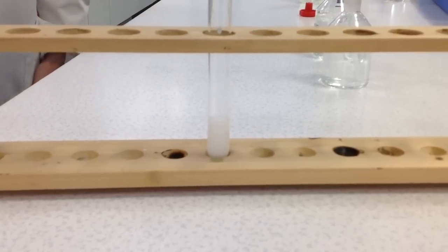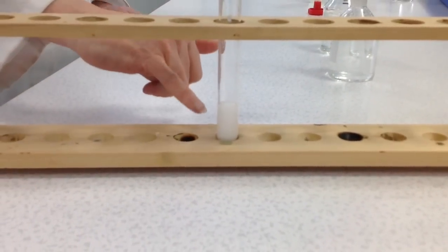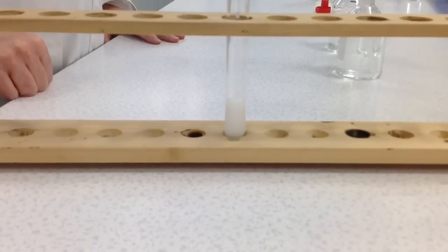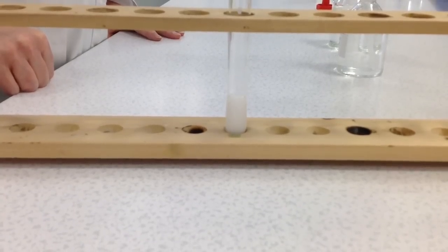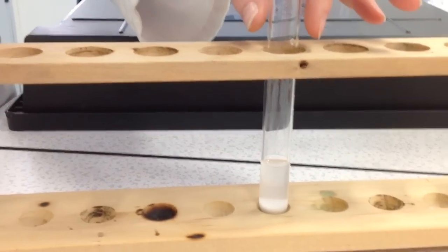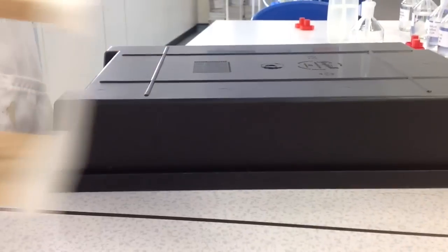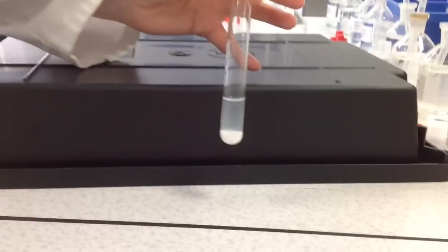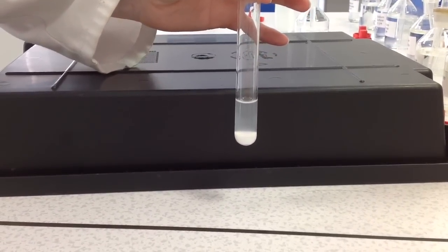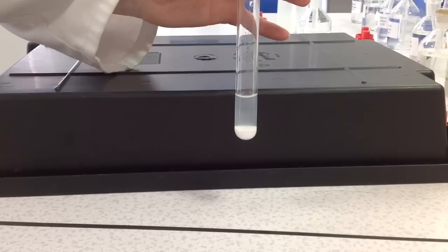Now if you let it stand for a few minutes, the precipitate will sink to the bottom so that you can clearly see the colours of both the precipitate and the solution. Here's the sulfate precipitate. We've left it to stand for 10 minutes and you can clearly see it's sunk to the bottom, and it's easy to distinguish now that it's a white precipitate in a colourless solution.